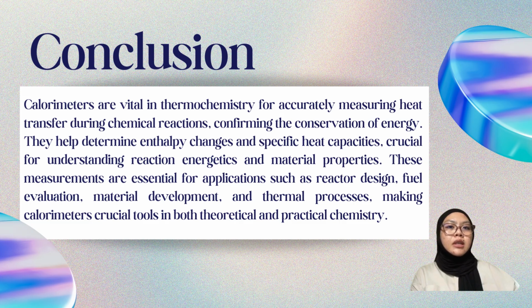These measurements are essential for application such as reactor design, fuel evaluation, material development, and thermal processes, making calorimeters crucial tools in both theoretical and practical chemistry.